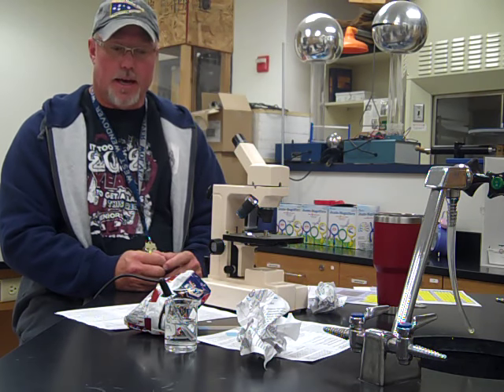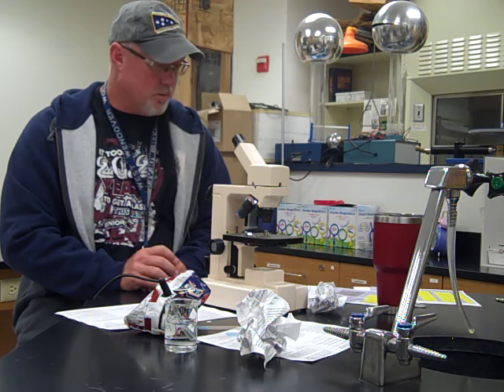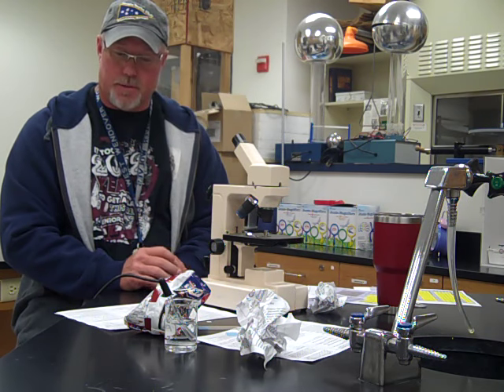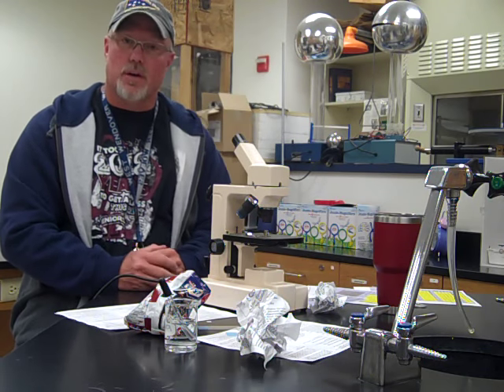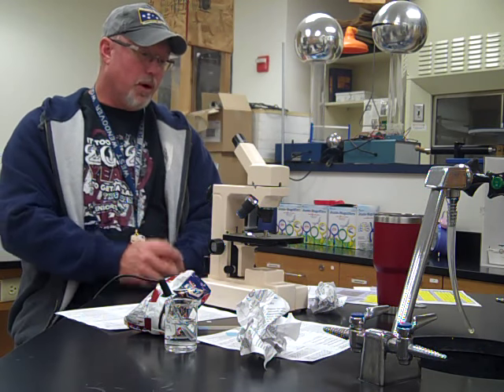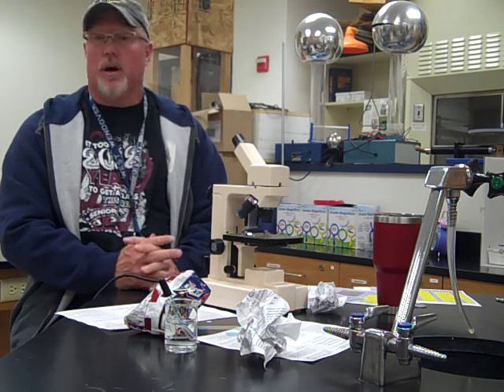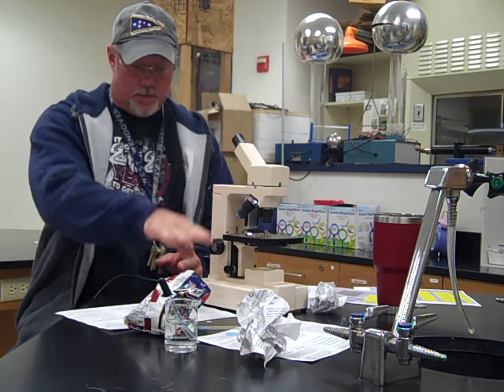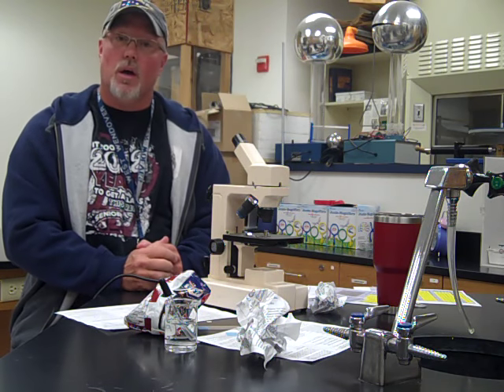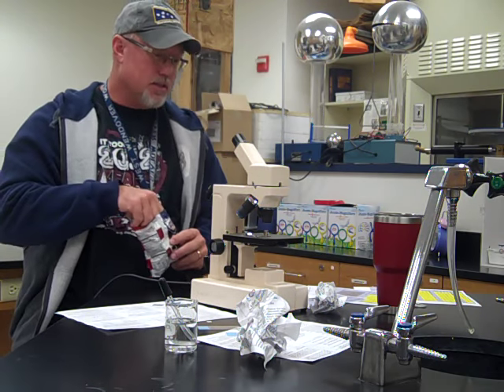Proper care and handling of the microscopes is extremely important when you're doing a lab and setting up and tearing down. You want to make sure that you know the parts of it. So we're going to go through the parts of the microscopes right now. They are not going to be in order of your sheet. I'm just basically going to go from the top of the microscope all the way down. So let's get started here.